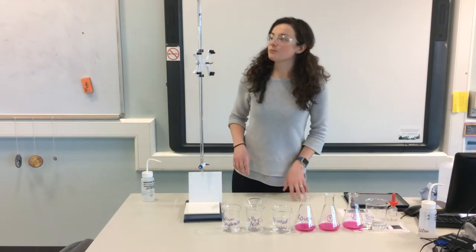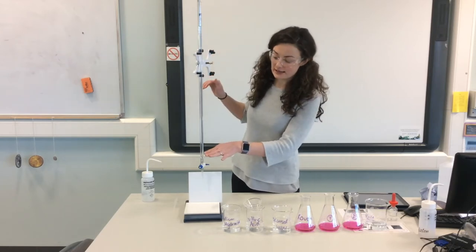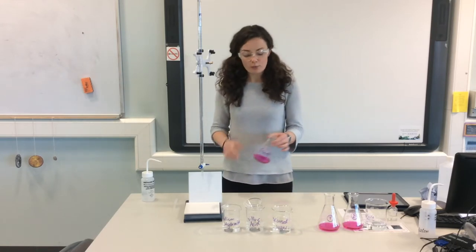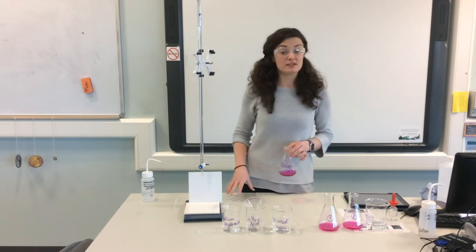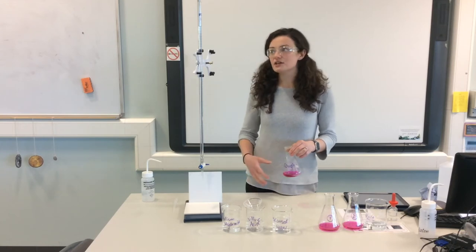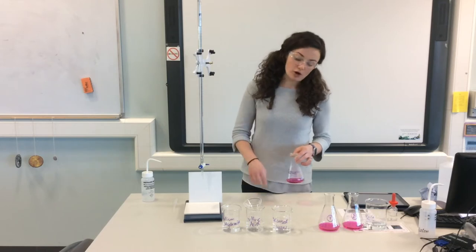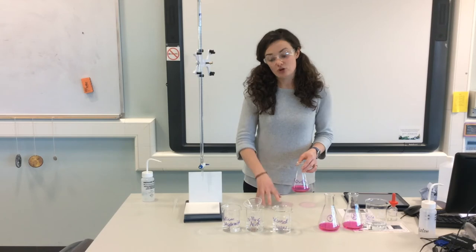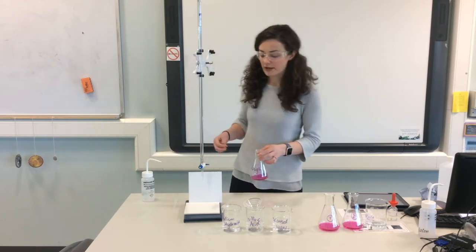So what we've got here is our burette, and our burette is filled to zero, zero at the top, and it contains 50 centimetres cubed. It's a 50 centimetre cubed burette. What we're going to do now is our first, our rough titration. With this, we don't need to be very careful. We just titrate until we see the colour change. Now, obviously, you don't want to do it too quickly or look away, because remember, our rough must be greater than our first and second accurate, but no more than 2 centimetres bigger. So we want to make sure we're being somewhat careful.